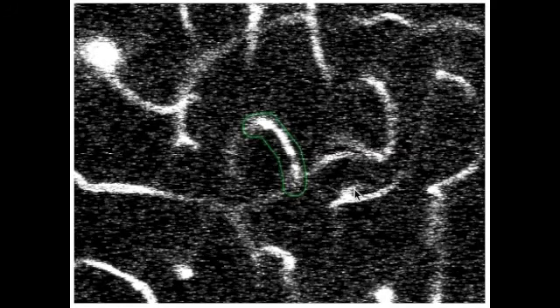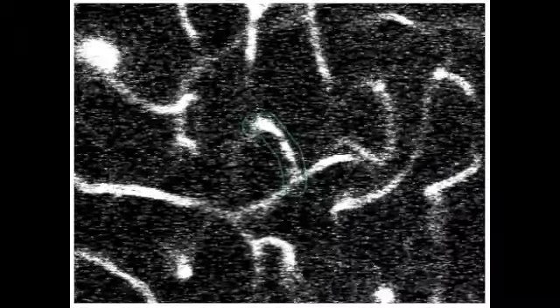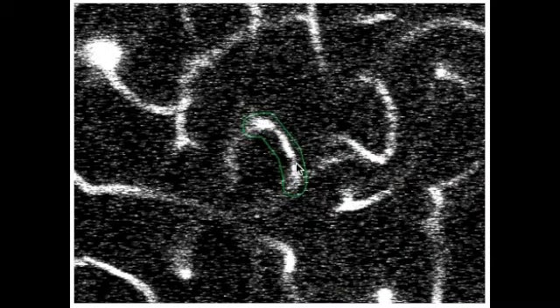Strikingly, there is a dark gap here. The question is, is this gap representative of a stall? If it's a stall, that gap will stay in the same spot throughout the movie. If it's a flowing vessel, we'll see that gap move one way or the other through the vessel. Regardless of which way we move the slider, that spot remains. So this looks like a stall, and we'll go ahead and mark it as a stall.